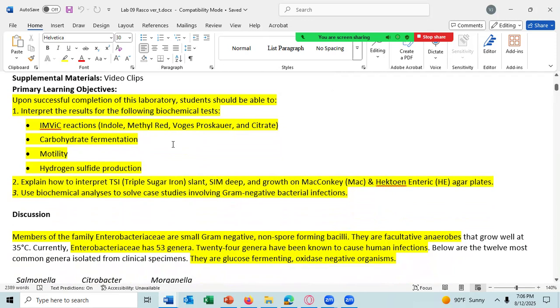You should be able to understand and give the results for the carbohydrate fermentation test. And that could be many different sugars. I won't ever ask a question where you're supposed to do like 5 different sugars, but it could be glucose, sucrose, lactose, mannitol, and inulin. So 6 different sugars. You could have other sugars, but we don't have that in the table.